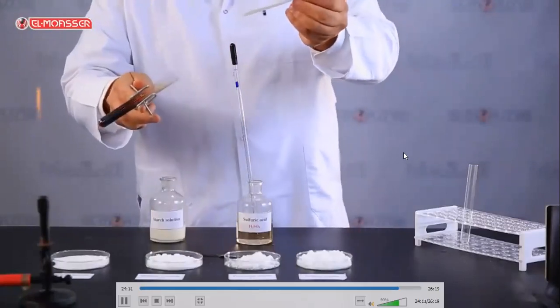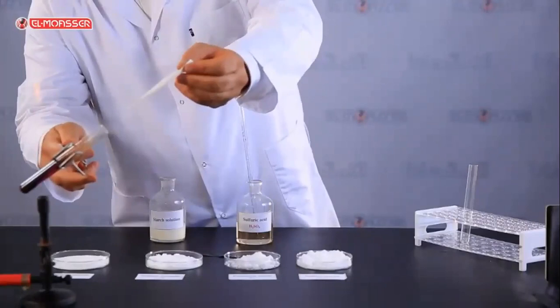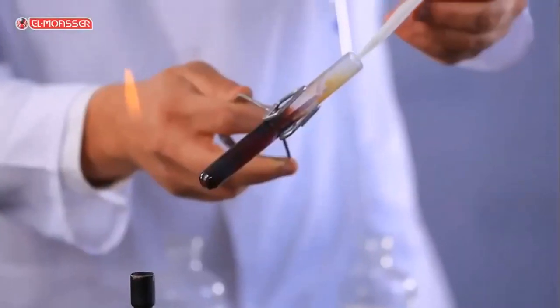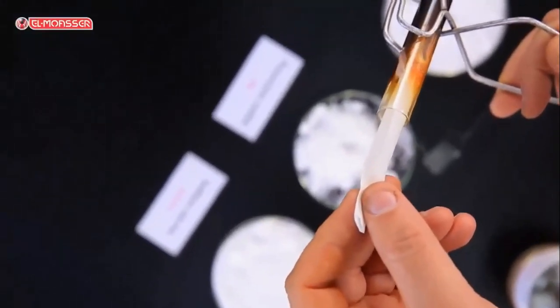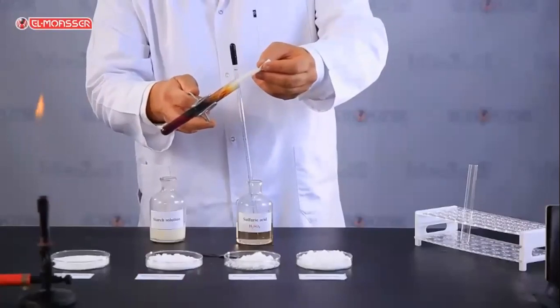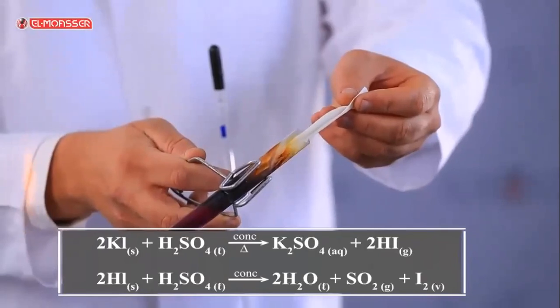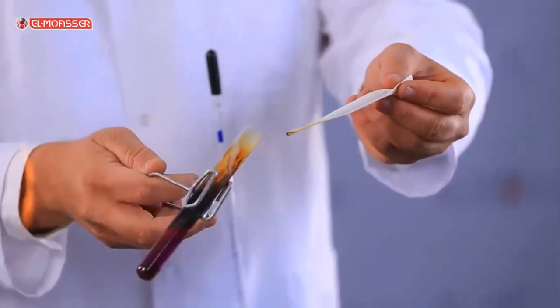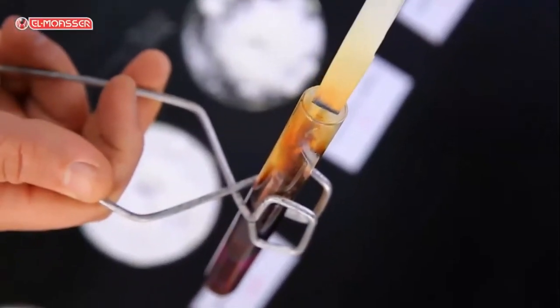What do you observe? With heating, hydrogen iodide gas evolves, which is colorless and partially oxidized quickly by sulfuric acid, and violet fumes of iodine are formed and increase by heating. The violet fumes of iodine turn a paper wetted with starch into blue.